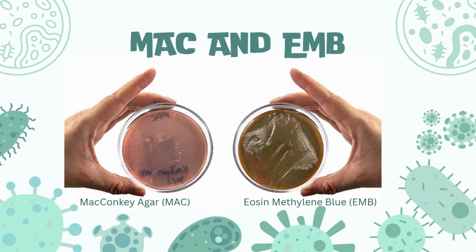Next, I tested the organism on EMB and MacConkey agar, both selective and differential media designed primarily for Gram-negative enteric bacteria. My organism showed very slight growth on both media, but no significant color change. This suggested two important interpretations.